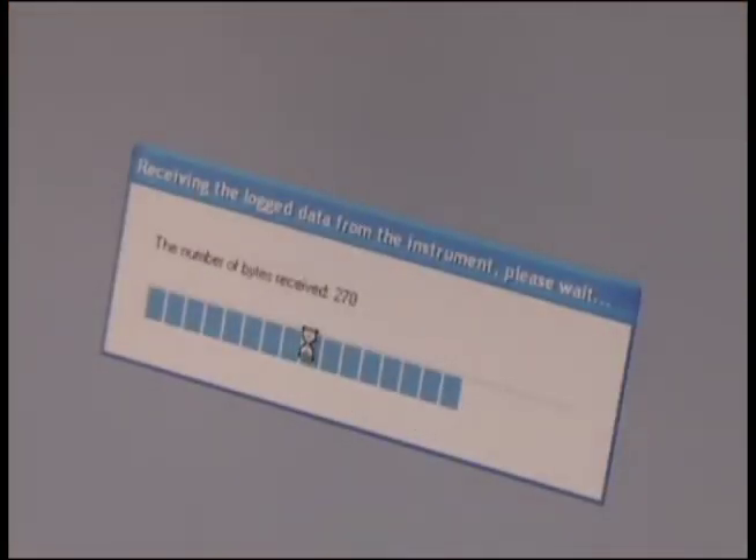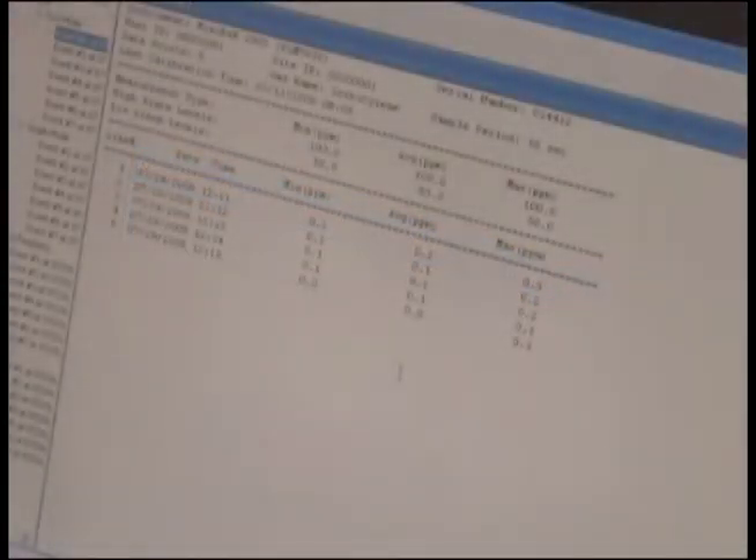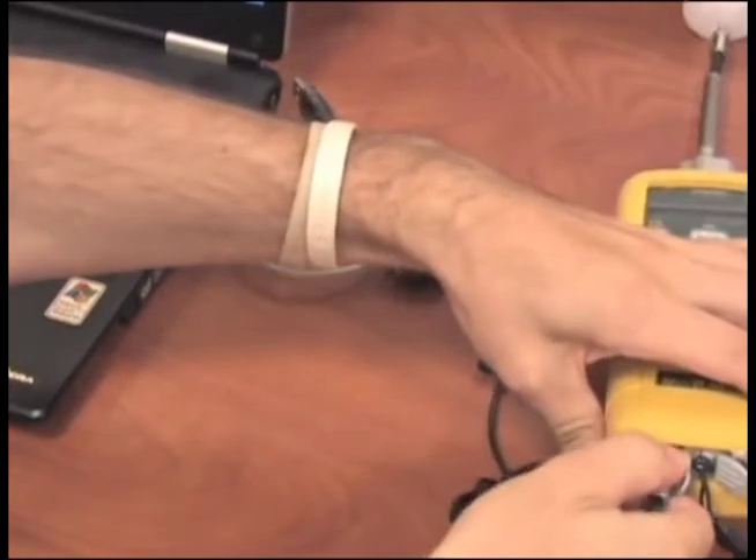When data transfer is complete, the report will open up so you can save, print out a copy, or import to another document. When you have completed all report functions, disconnect the unit and shut down or remove the CD.